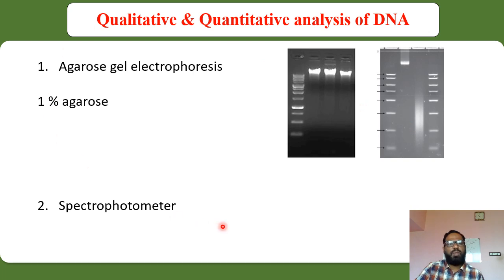And now we are going to discuss the qualitative and quantitative analysis of the DNA molecule. I already said that once the DNA is extracted, we have taken maximum precaution to remove the protein and to remove the RNAs. But what is the guarantee that we have removed everything? That's why we have to go for some scientific methodologies, and by using those techniques, we can analyze whether the extracted DNA molecule is of desired quality or not.